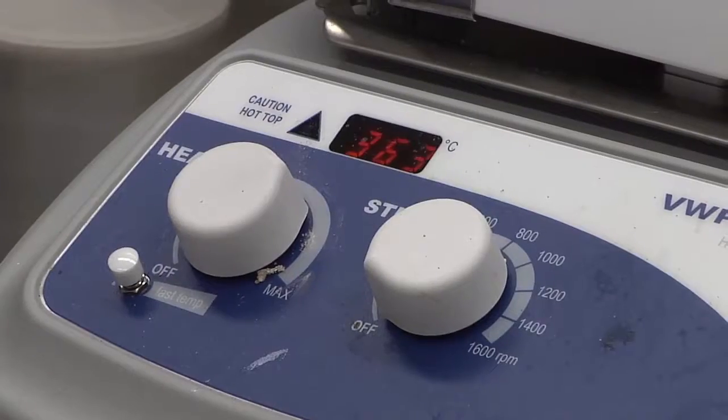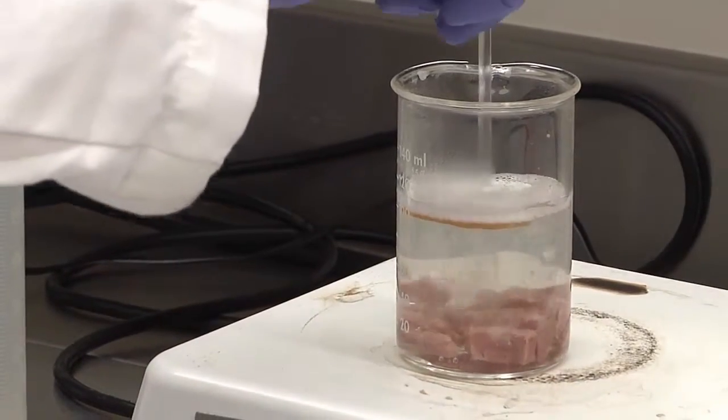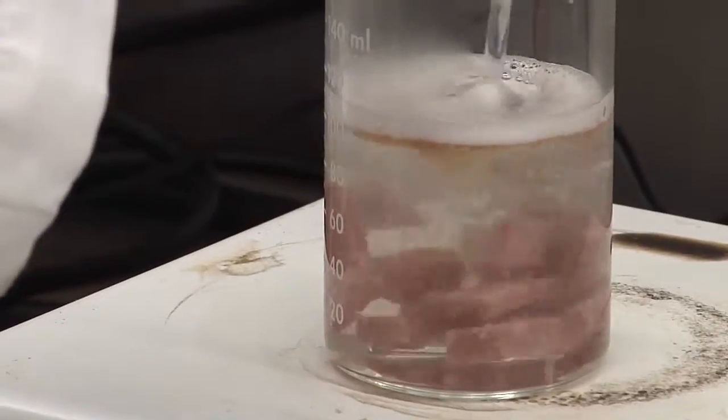Place the beaker on the hot plate and heat until rolling boil. Stir occasionally with a glass rod so that the product does not clump or stick to the side of the beaker.